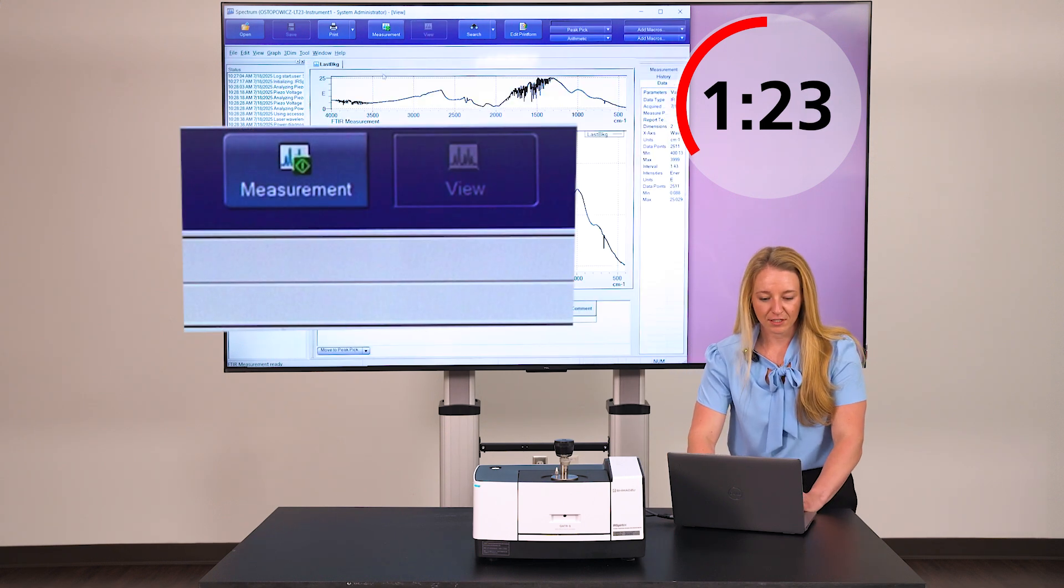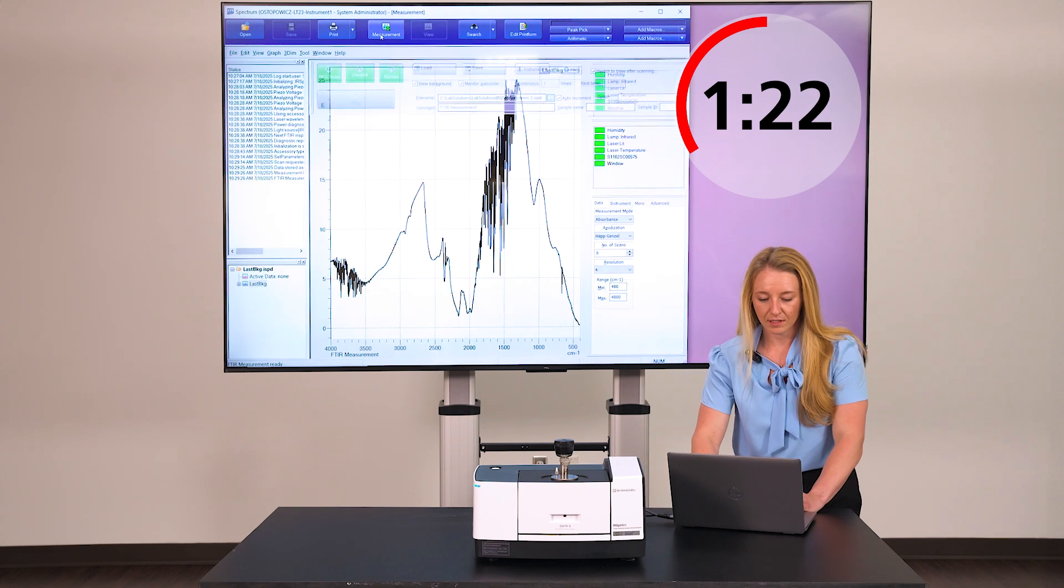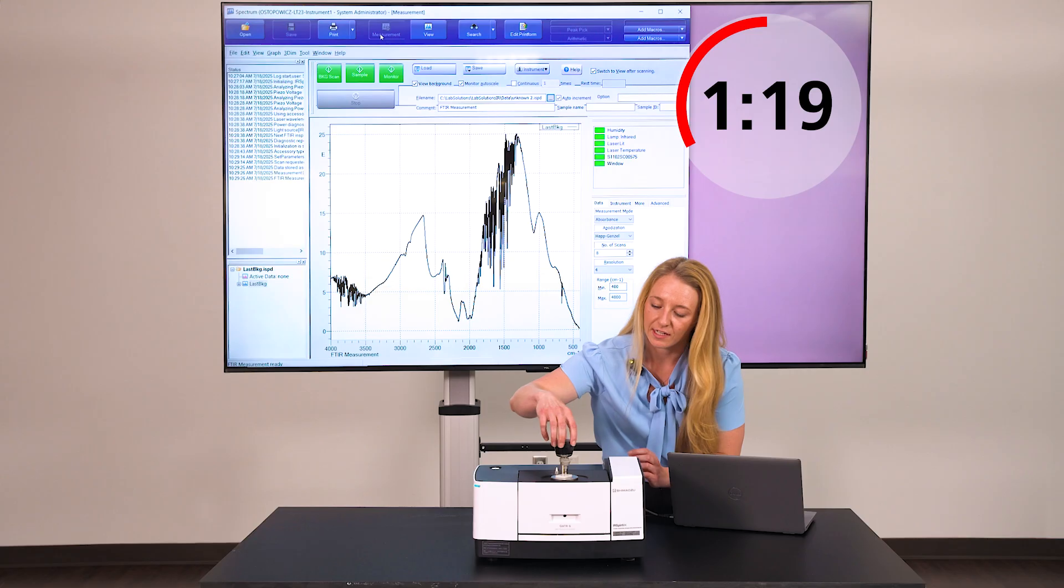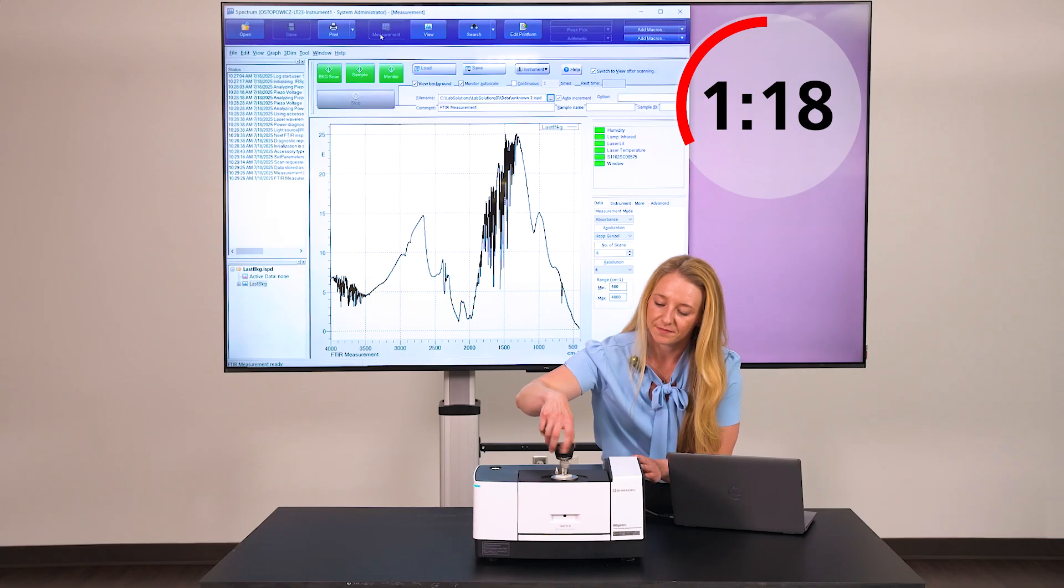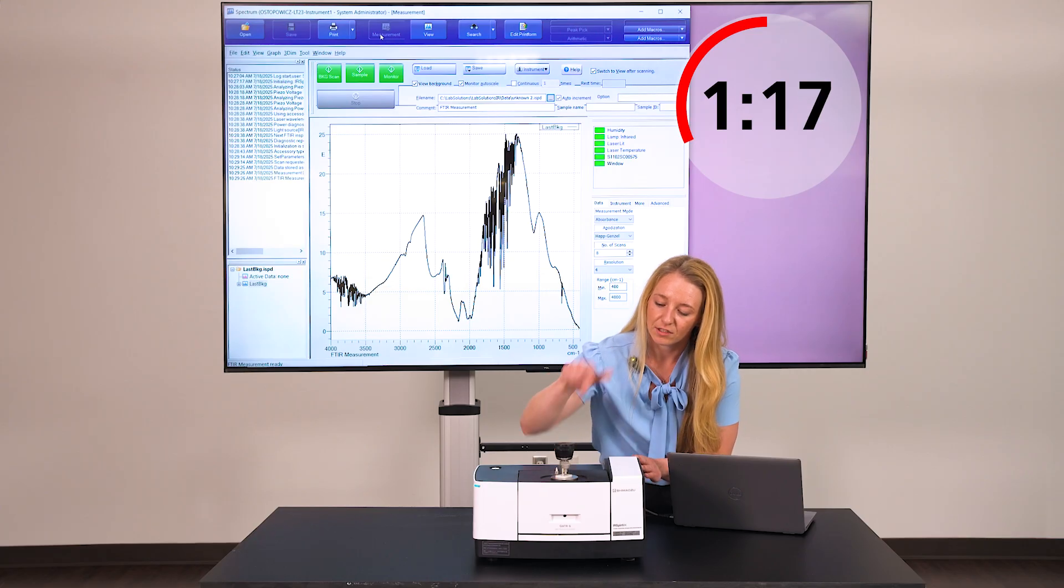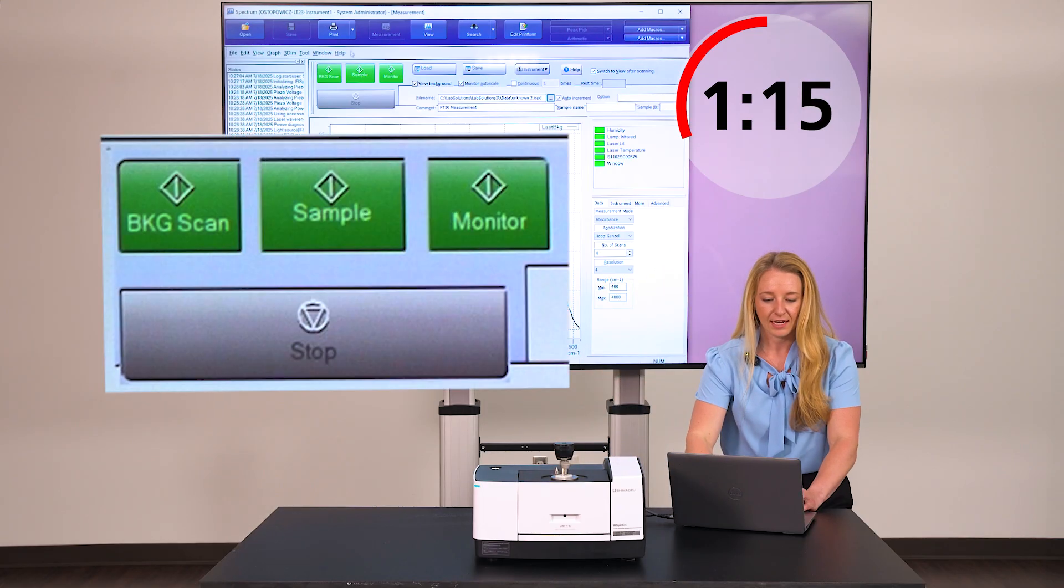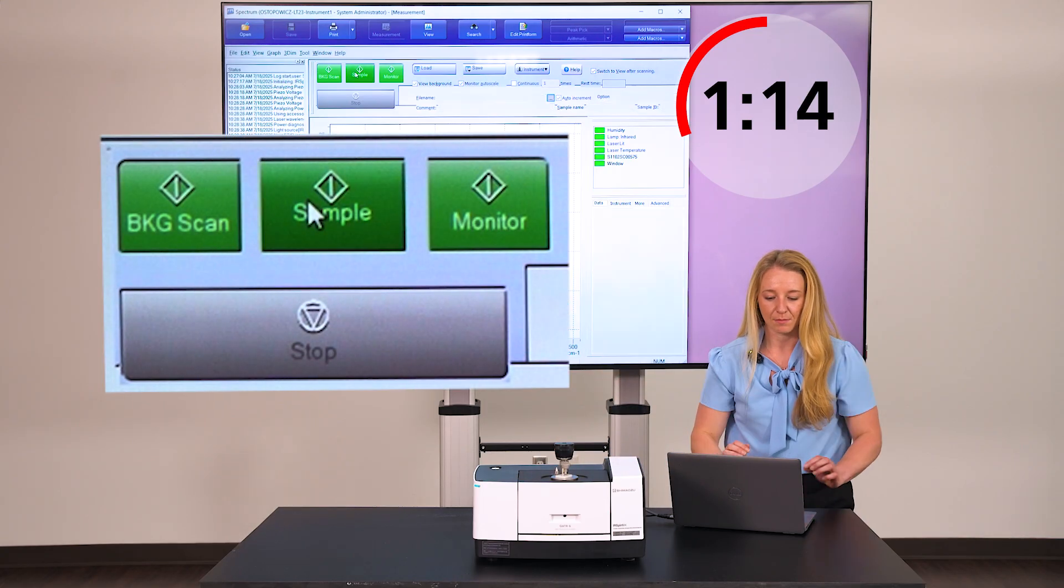Go back to measurement and load your sample. Place it on the ATR, screw down until it clicks, and hit sample.